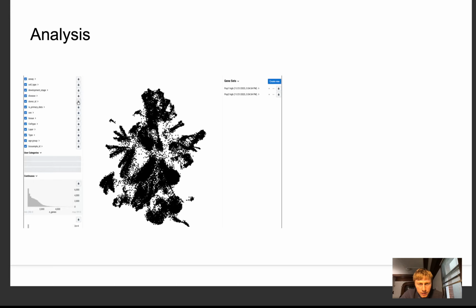All right. So quickly, I also made a summary of scanpy and Seurat. You can read through it.